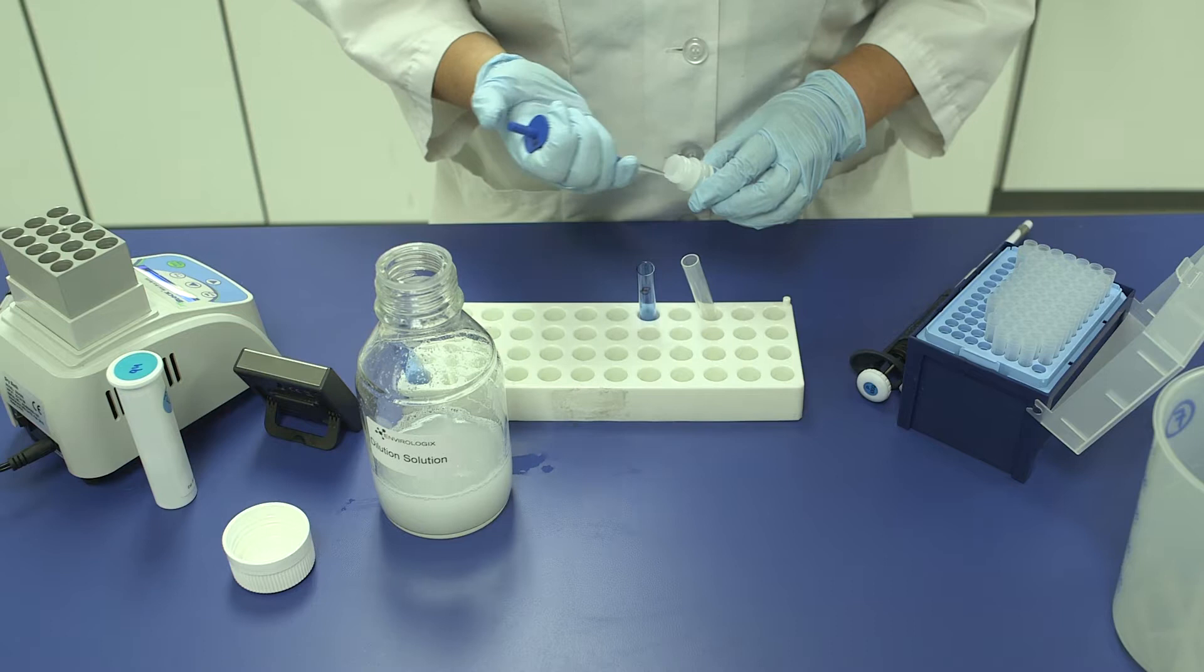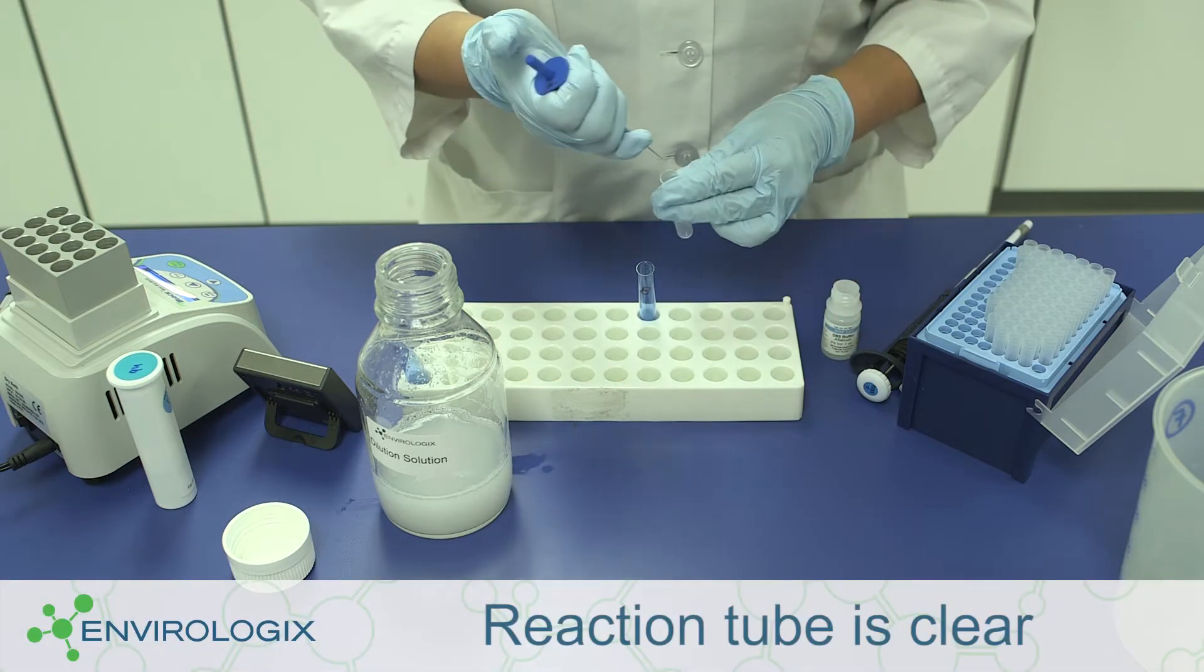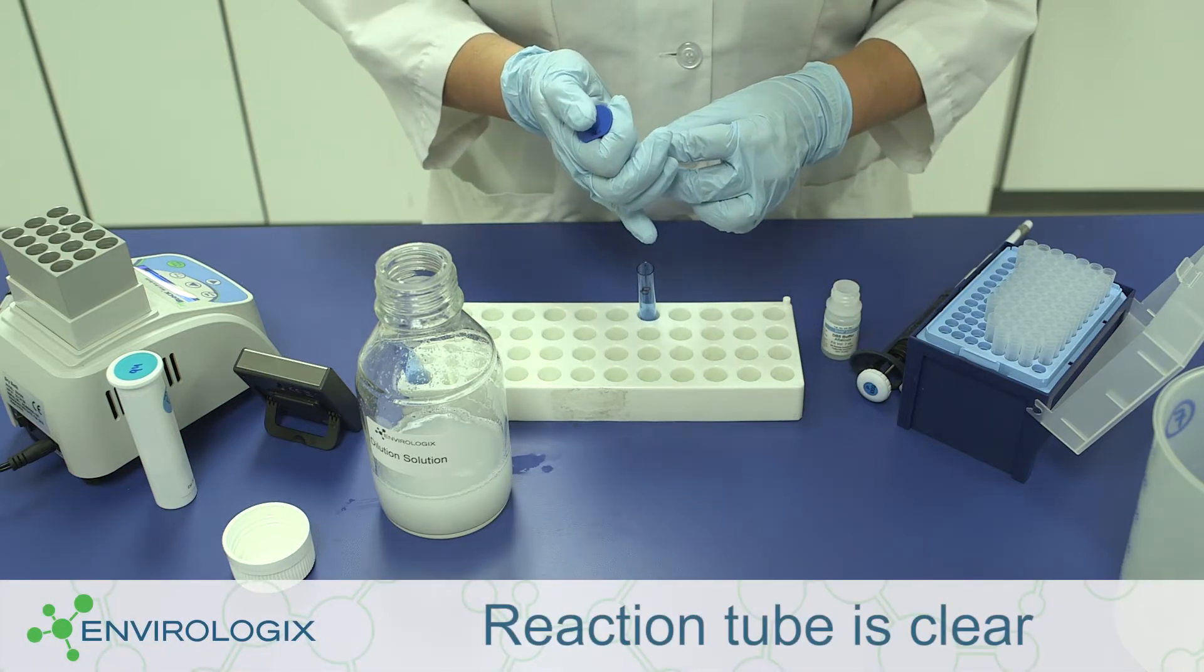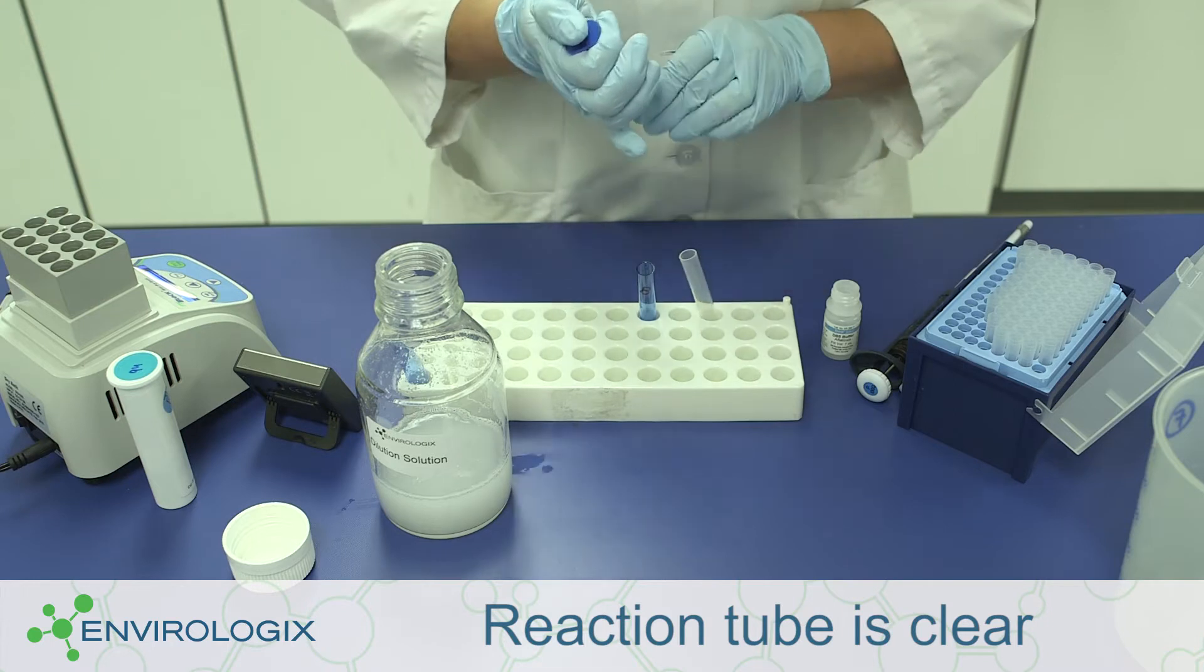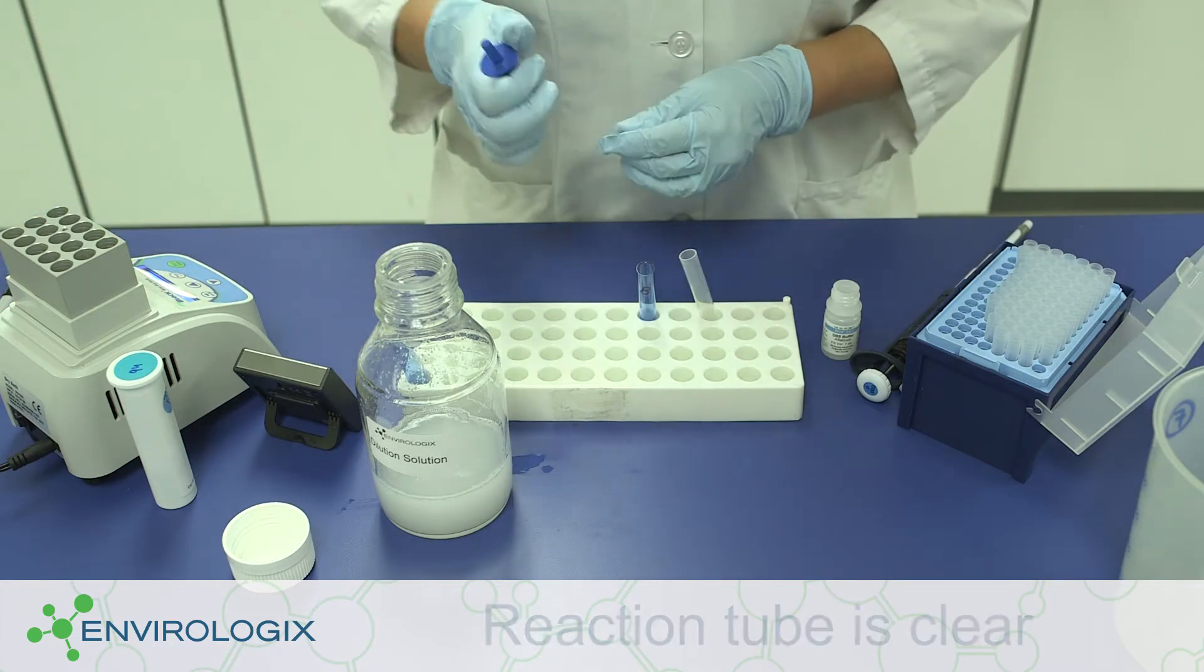Step 2. Pipet 100 microliters of DB5 buffer and 100 microliters of the diluted extract from Step 1 into a new reaction tube and mix well.